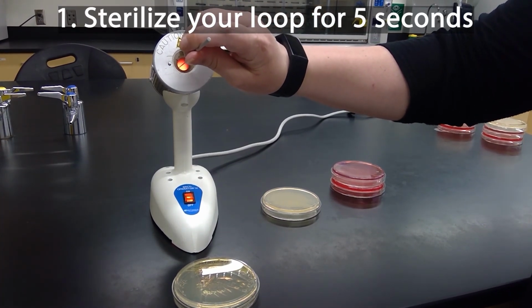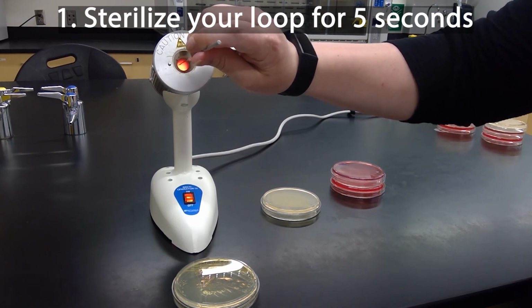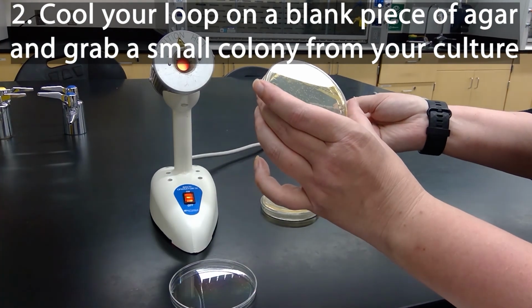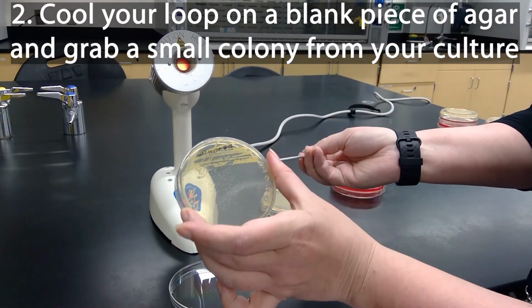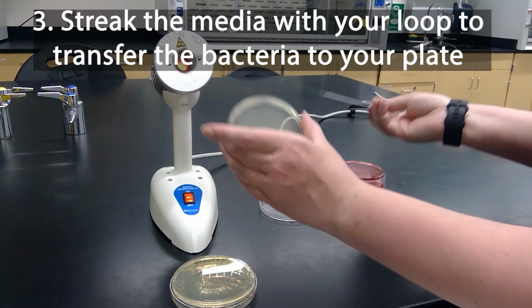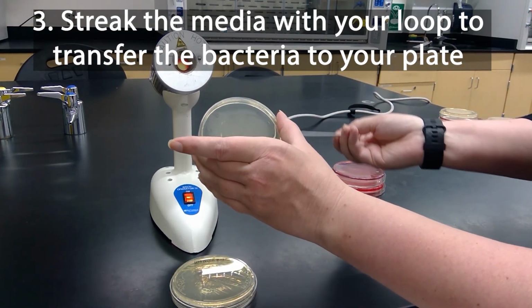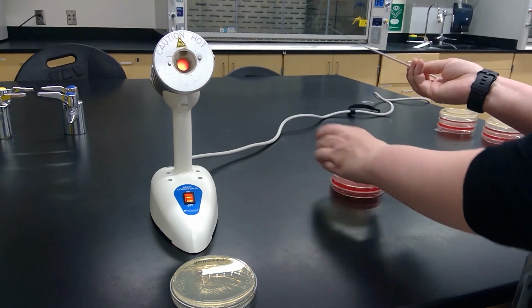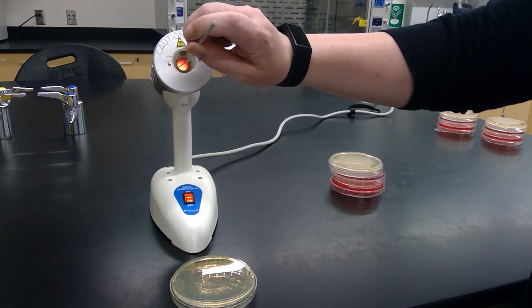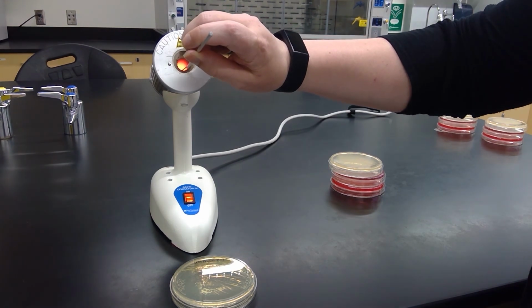And then we'll grab some culture, streak it onto our PEA plate, and then sterilize our loop again.